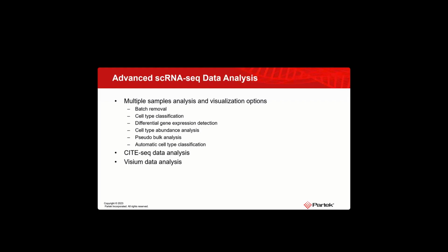Okay, so in the previous session, we talked about some basic skills on single cell data analysis using one sample in Partek Flow. And today, we're going to talk about how to analyze multiple samples of single cell RNA-seq, what options you have for analyzing the data, and different ways to visualize the data.